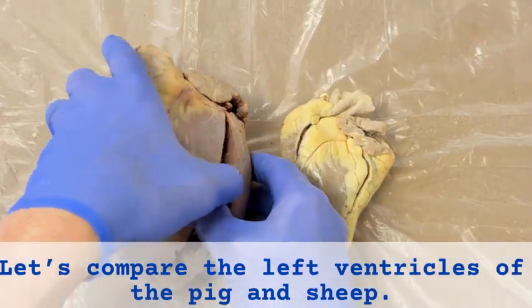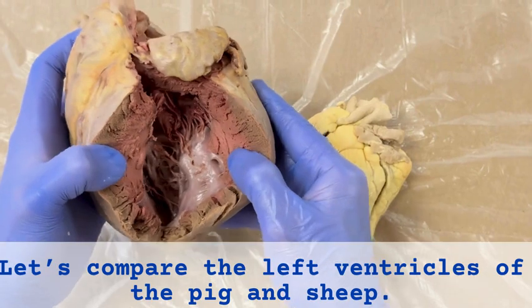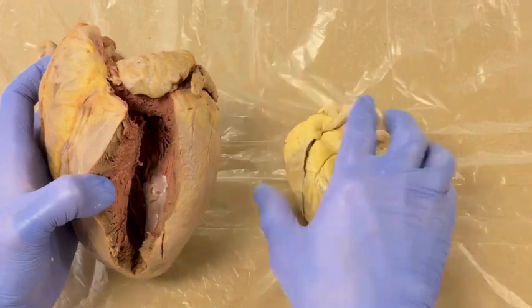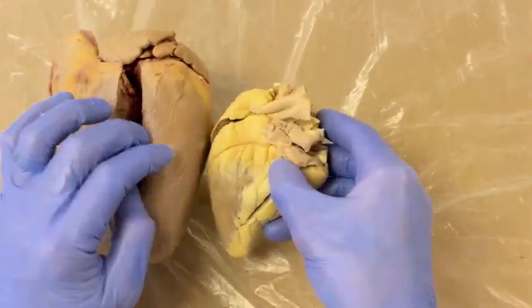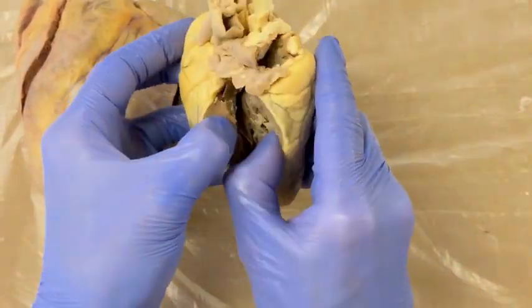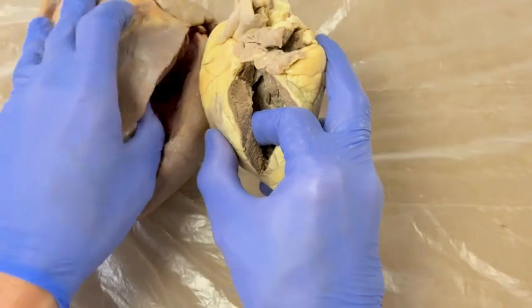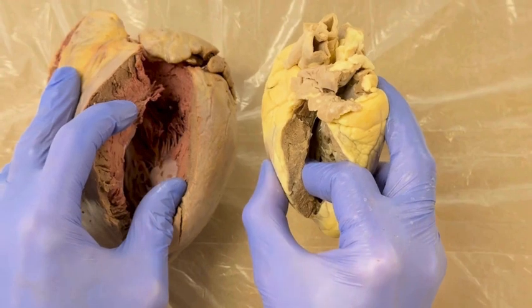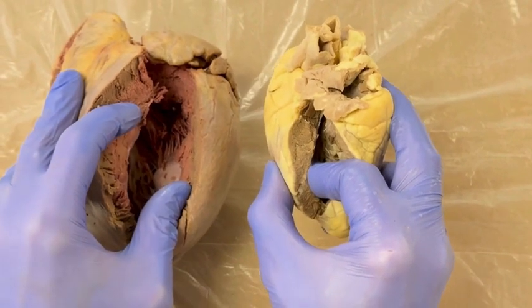So the pig heart, as our example, this is the left ventricle of the pig, the pumping chamber to the body. And look at that thickness compared to the thickness of the sheep heart. The sheep has a much thinner wall compared to the pig, and that's because the sheep is a smaller animal and pumps much less blood flow than the pig.